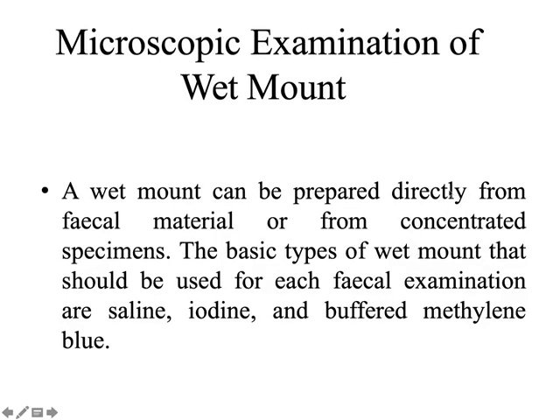Okay. So we have something called wet mount. The wet mount can be prepared directly from the fecal material or from a concentrated specimen. The basic types of wet mount that should be used for each fecal examination are saline, iodine, and sometimes buffered methylene blue.